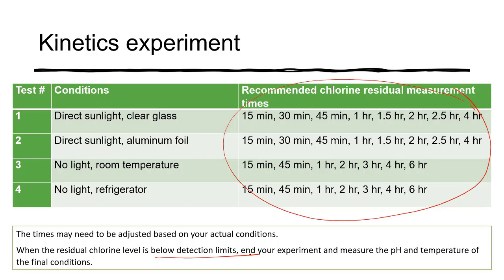I did this during the summer. It was a much warmer day, greater sun intensity because it was the middle of summer. So you'll get different results than what I do. You'll need to record the temperature. You also want to record the outside weather temperature. You also want to record, is it a sunny day, cloudy day, etc., because that affects your rate constant.